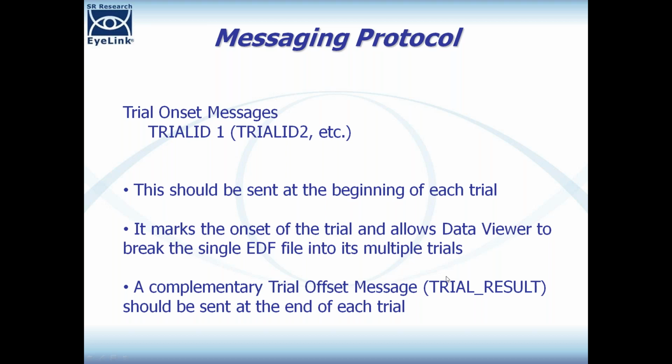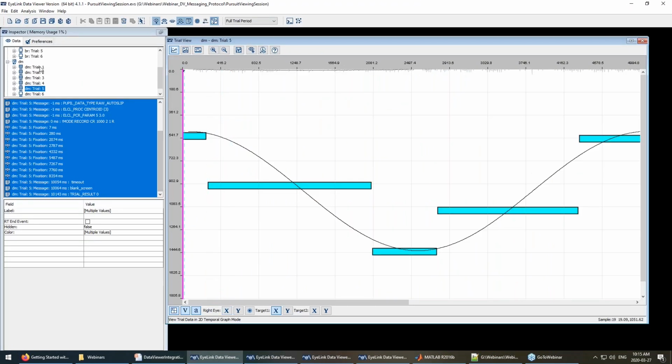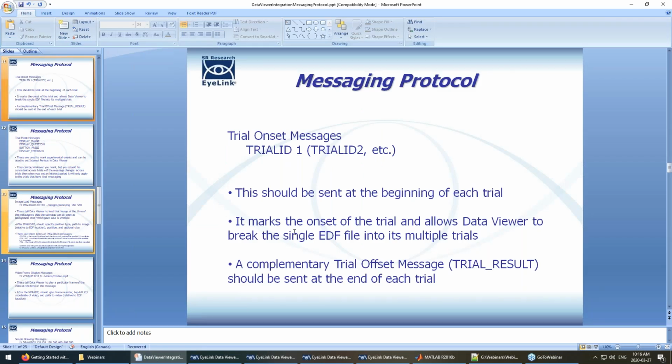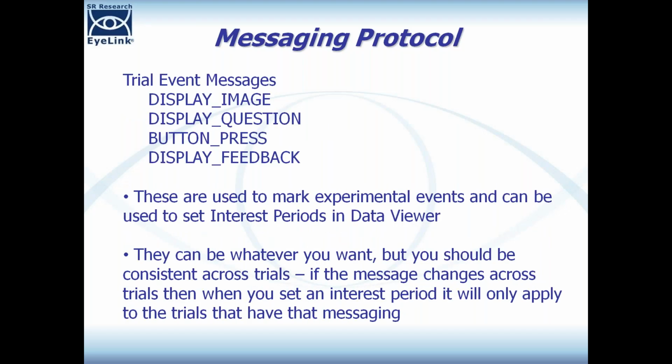When you import an EDF file into Data Viewer, you'll be able to see the EDF file name here, and see how Data Viewer has broken it down into the different trials. That's a result of these trial ID messages. I don't know why it's freezing up here. Okay, there. So that's what we do at the very beginning: mark the beginning of the trial.